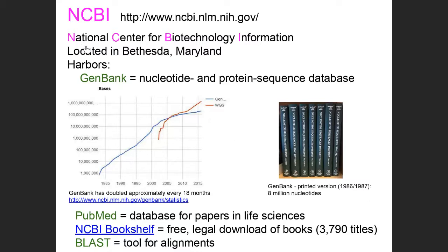All right, remember when we ran MUSCLE and Clustal, and I told you EBI is the European NCBI. Here's a little bit more about NCBI: it's the National Center for Biotechnology Information. It's maintained by tax dollars.